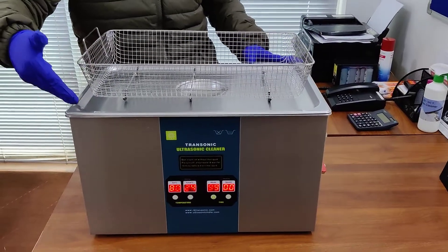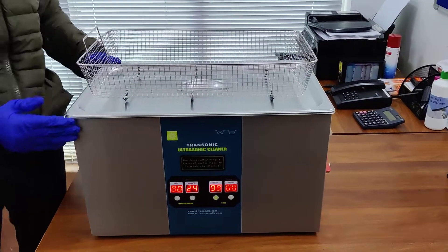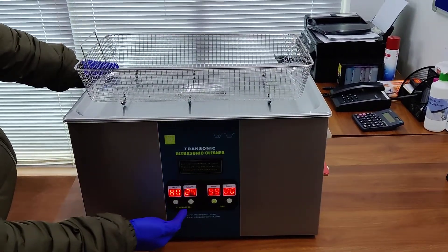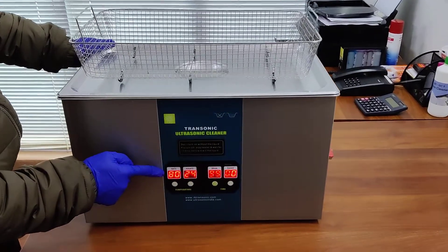This is our 22 litre ultrasonic cleaning machine. This is a tabletop model. It comes with a digital temperature controller. The maximum temperature can go up to 80 degrees Celsius.